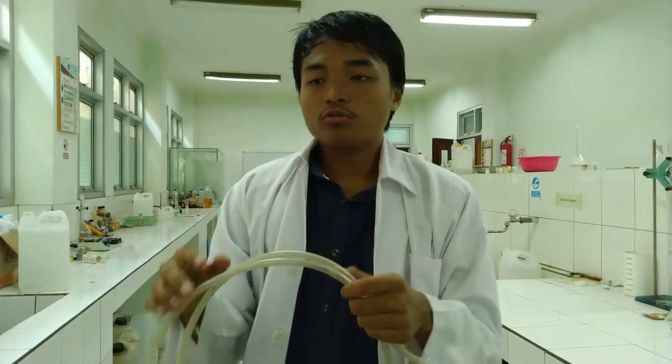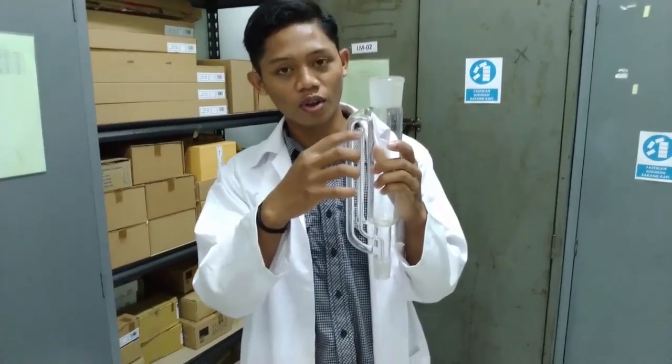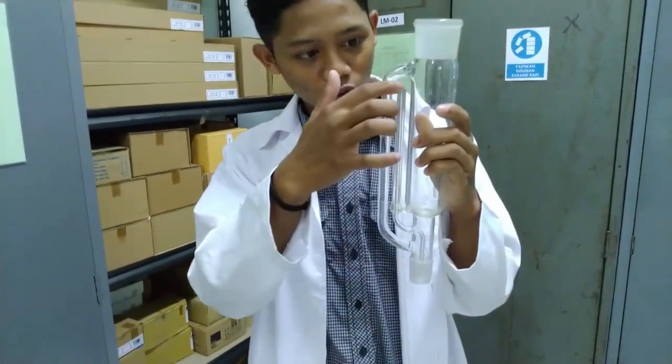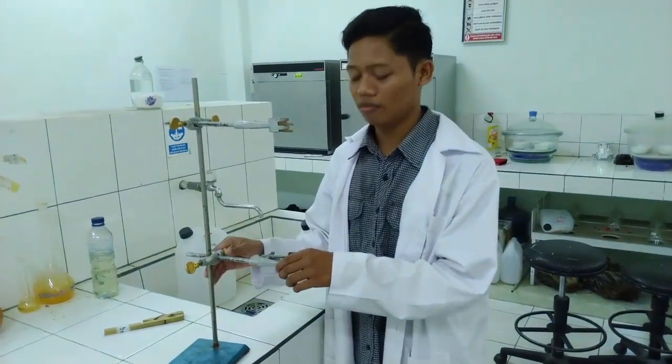Ini adalah selang yang akan digunakan untuk mengaliri air dari ember ke dalam proses ekstraksi. Ini adalah tabung soklet. Tabung soklet sendiri berfungsi menampung hasil ekstraksi dari ekstrak minyak atsiri. Ketika minyaknya sudah penuh, minyak tersebut akan kembali turun melalui pipa ini kembali ke dalam labu. Di sini ada klem dan statif yang digunakan untuk menjepit kondensor dan tabung soklet pada saat proses ekstraksi.